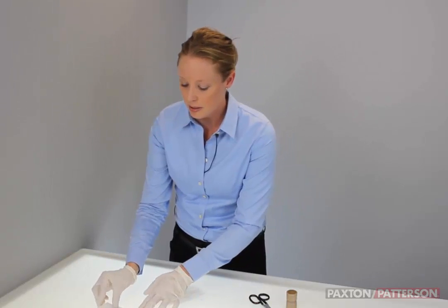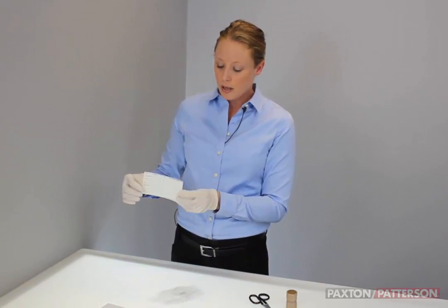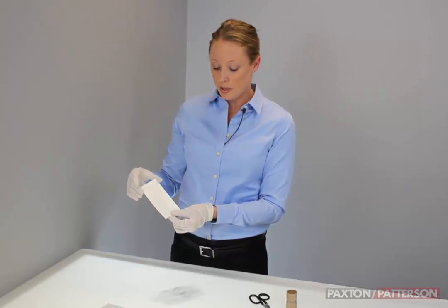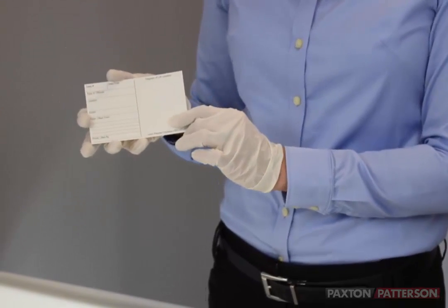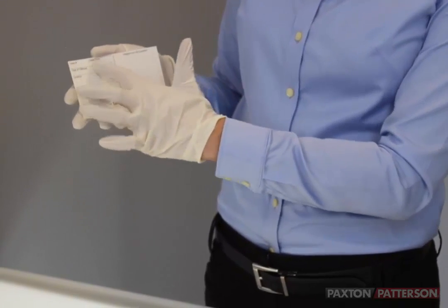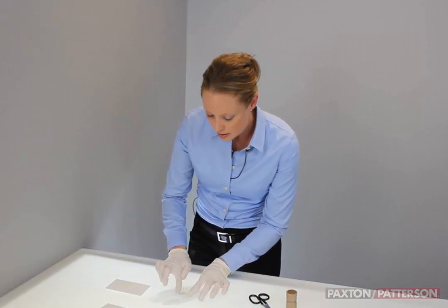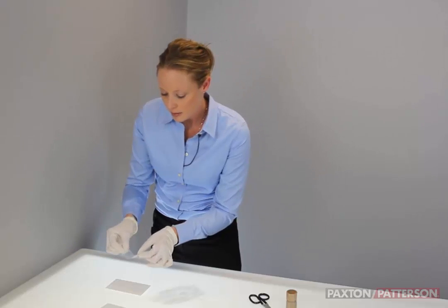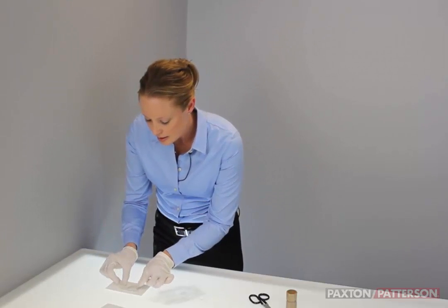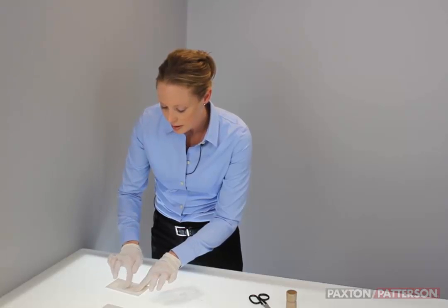I'll leave that for just a second and grab what we call a lift card. This is the back of the lift card — the front is glossy. The glossy part is where you want to put your fingerprint lift. The back is where you can draw a diagram of where you removed the lift from, and it has lines so you can put your case information. I'll set the card down. The print is nice and smoothed out. I'm going to slowly peel back, grab the tape, and just lay it right down on the back of the lift card and smooth it out.